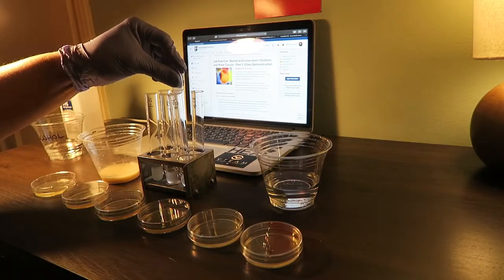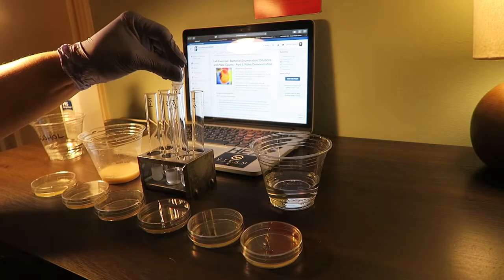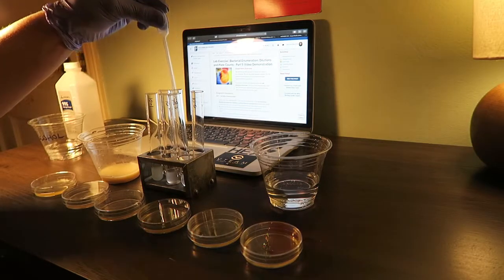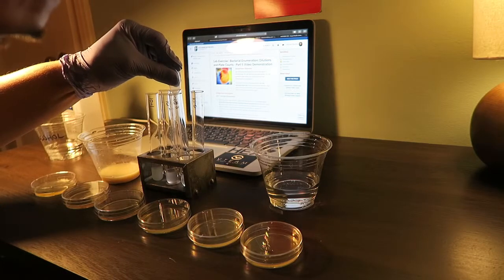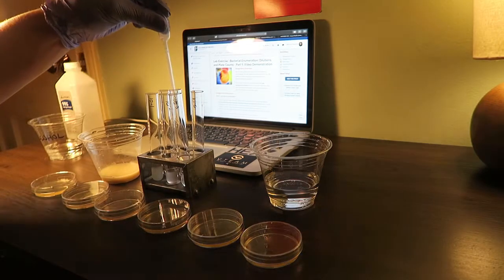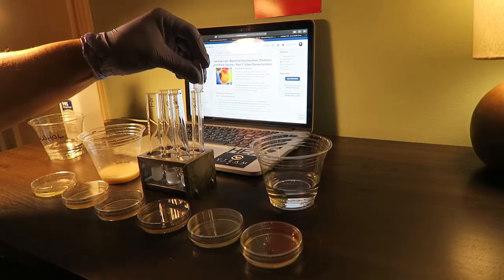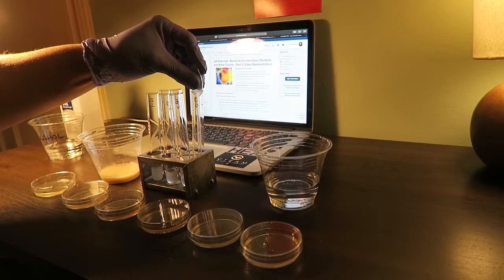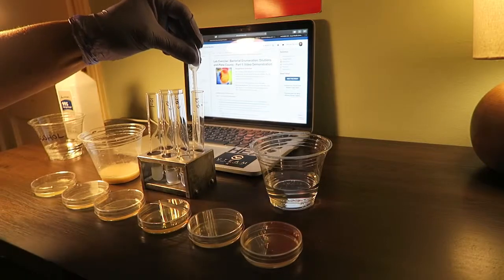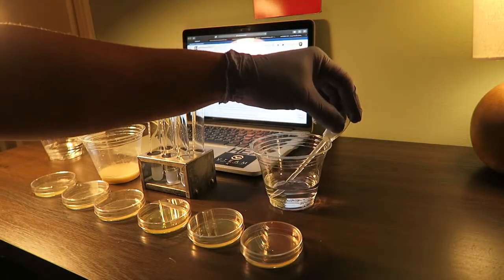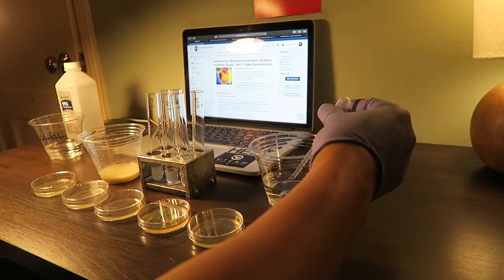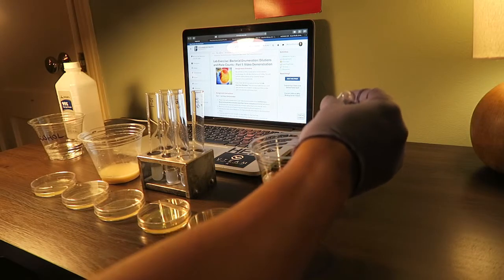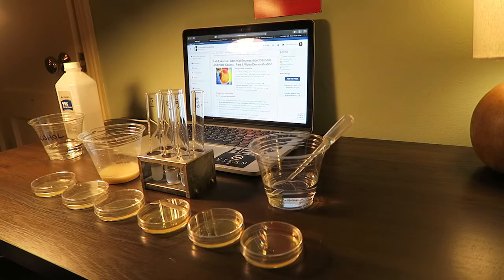Then I'm going to transfer to tube five, and then to tube six, and then rinse the pipette in distilled water.